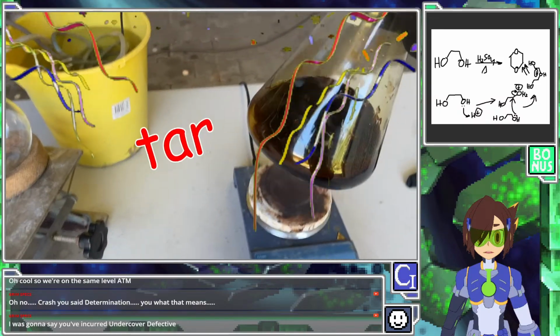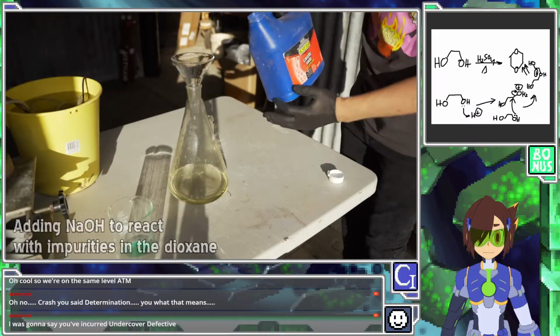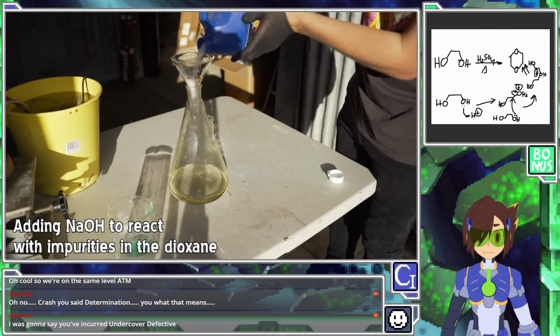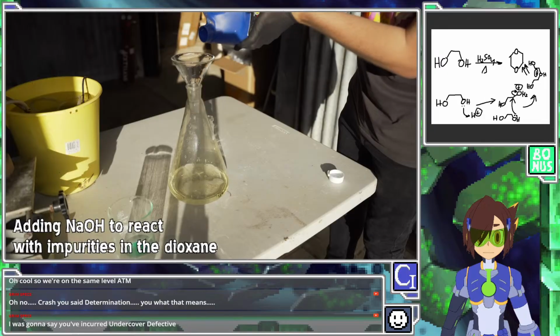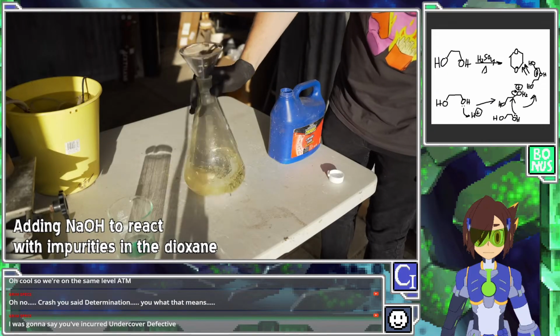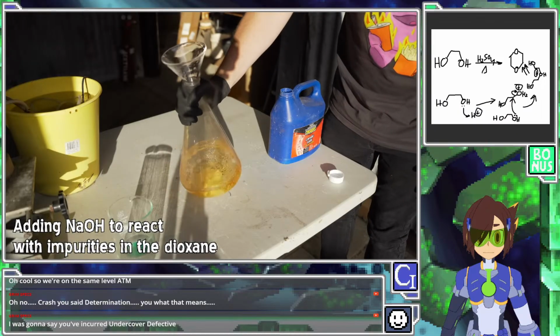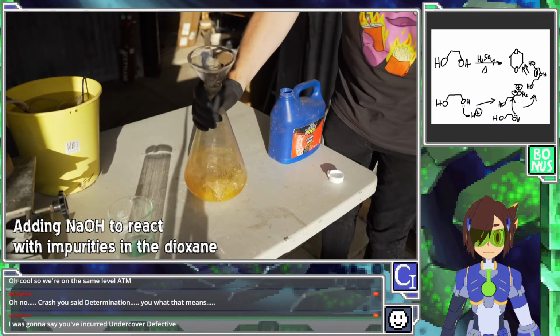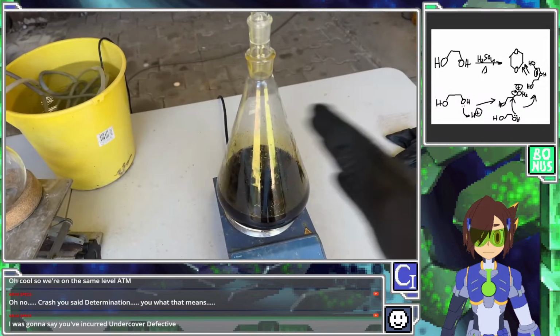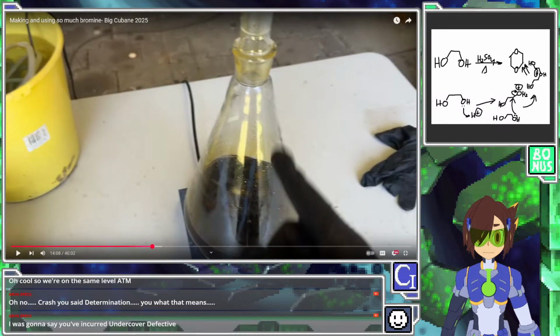All right, welcome. This is our tar that contains our dioxane. It's not meant to look this bad. I just got this procedure slightly wrong. You do add sodium hydroxide into the dioxane to make all these impurities tar out and separate the dioxane and the water. But really in the procedure you run another distillation first before adding the sodium hydroxide to remove most of the impurities before doing this sodium hydroxide bit. So that would in fact make sense.